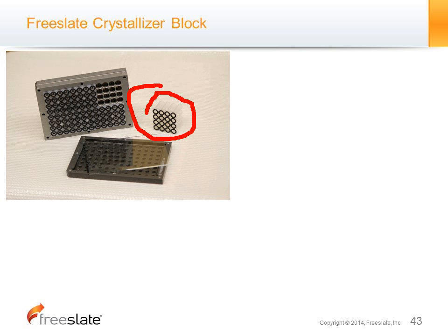I assume that the tubes and the gaskets that you've got circled right now are disposable, or can you reuse them? We do reuse them, and I think Freeslate's one is a consumable product, so it's not like we can reuse them forever. But we can definitely reuse them. We do wash them and reuse them at least 3 or 4 times before we discard them.